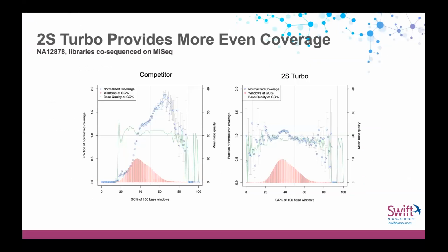And then another thing that becomes very important in the library prep stage, before we get to the data analysis through VarSome, is that in these preps, if you're not capturing the full complexity of the sample with the library prep, then when you go to do the hybridization capture to enrich just the sequences of interest, you're going to be putting at risk your ability to actually capture that complexity.